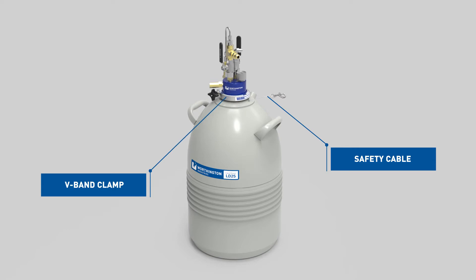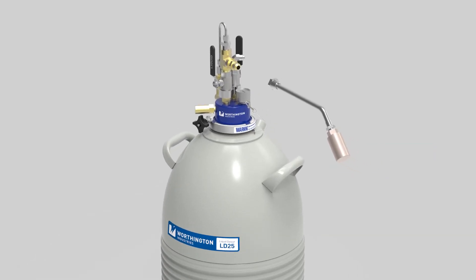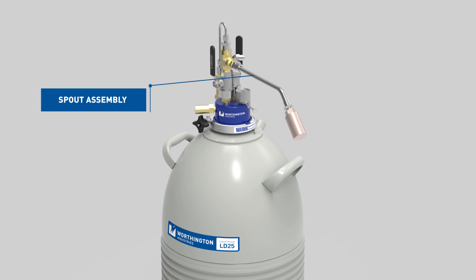Place the band clamp around the flange of both the liquid withdrawal device unit and the Dewar. Be sure the clamp is properly engaged on both flanges and tighten the clamp by hand only. Attach the snap of the safety cable to the ring on the liquid withdrawal device. If the spout assembly is to be used, install it on the outlet fitting above the liquid valve. The phase separator will ensure a controlled flow of liquid.